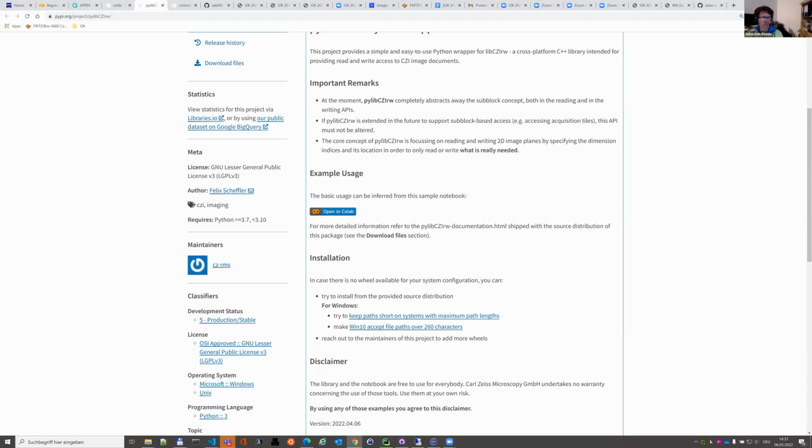And I already saw your question with respect to the metadata. You can write some metadata, not all of it. Pinhole size, zoom, etc. wouldn't be hard technically, but our approach was to first start with really a few metadata that are really required. Because pinhole size and zoom, and now it gets a bit technical, are not strictly speaking necessary metadata for a CZI image file. Those are hardware related data. If you have an LSM, obviously pinhole makes sense. If the CZI comes from a wide field microscope, then it does not.